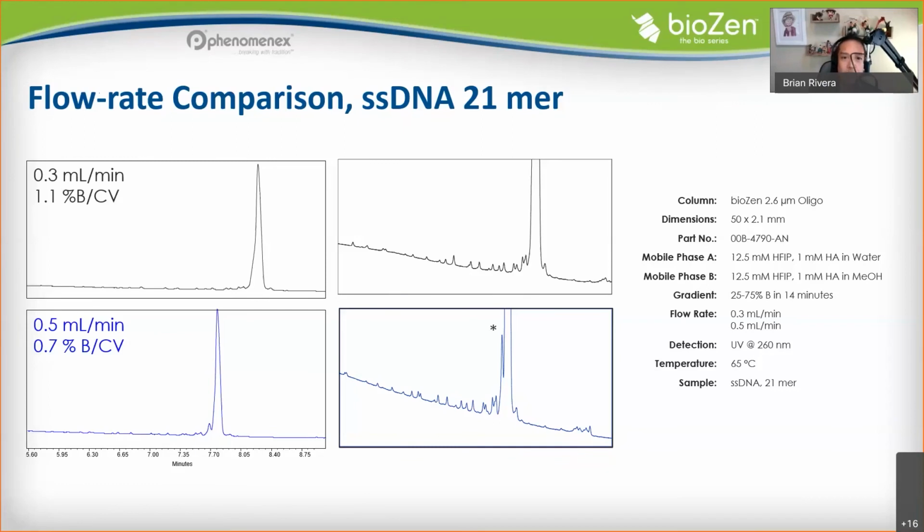I see this problem especially with folks working with proteins, but even with oligos. One of the ways people try to improve the separation is, instead of increasing the flow rate, they take the same gradient program and, instead of 14 minutes, make it 28 minutes, which could work. You've shallowed out the gradient slope in a certain regard, but now you have a method twice as long. There may be some question about the stability of that oligo, especially if you're running at higher temperatures. So for practicality's sake, who wants to run a 28-minute method if you can run a 14-minute method, right?